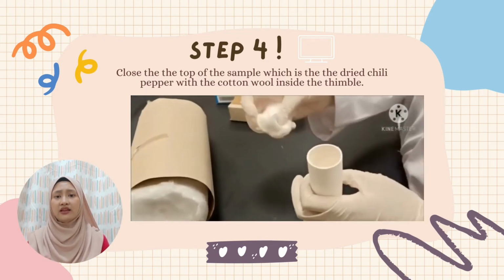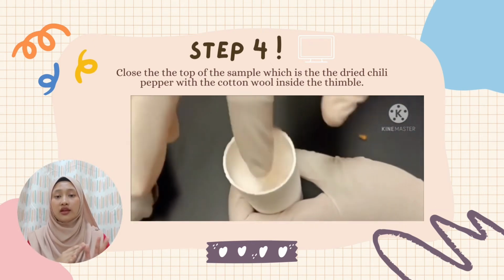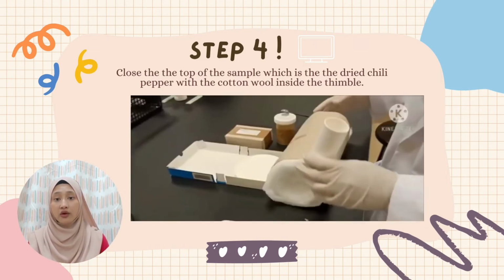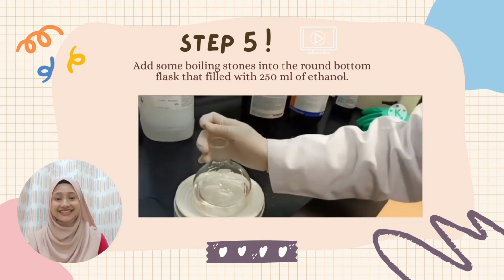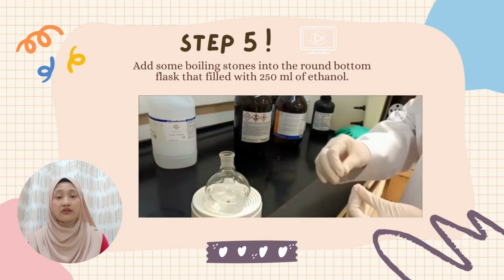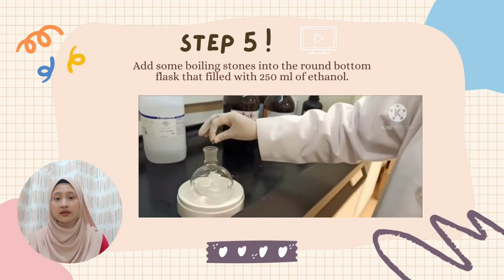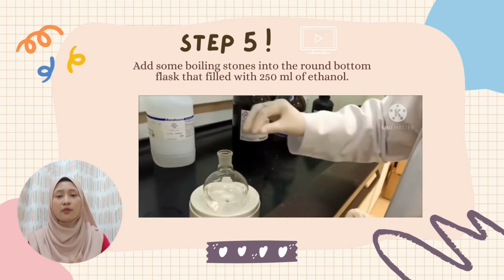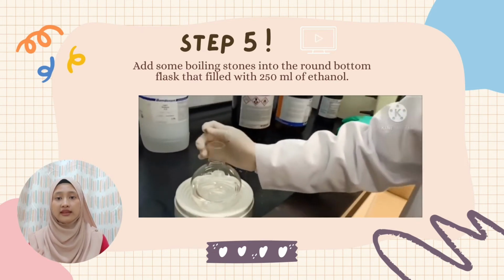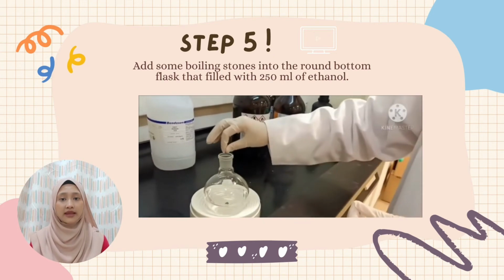Normally, cotton wool is placed on top of the sample in the thimble to secure its position within the thimble, as the sample may float out of the thimble. Then, step 5. Add some boiling stone into a round bottom flask that is filled with 250 ml of ethanol. A boiling stone is a small, unevenly shaped substance that is added to liquid to facilitate the boiling process by making them boil more slowly or calmly.